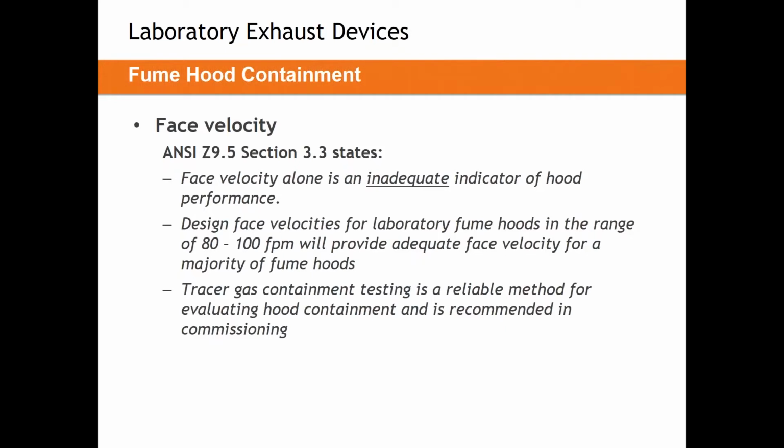That being said, again, most of what we talk about will be about fume hood face velocity. Sometimes we'll get the question about what face velocity should I use. This is typically provided by the fume hood manufacturer. Sometimes they'll say you need 80 to 100. Some will say you can go down to 50 or 60. If you don't know, a generally accepted number is about 100 feet per minute. That being said, again, that is just an estimate. That's just a general rule of thumb we use. If you have a specific reason to go with a different face velocity, that's perfectly acceptable.